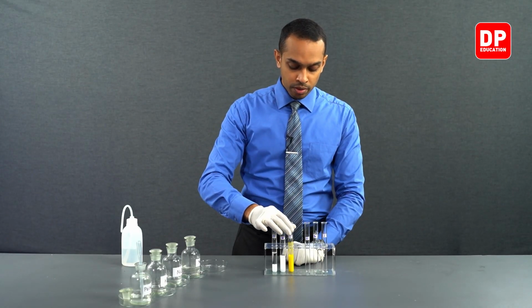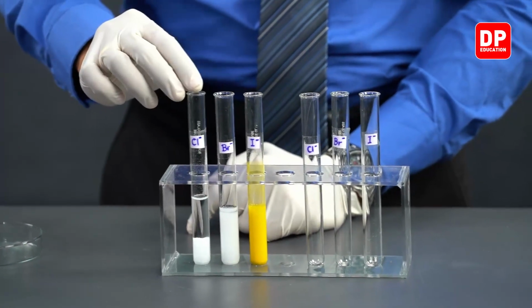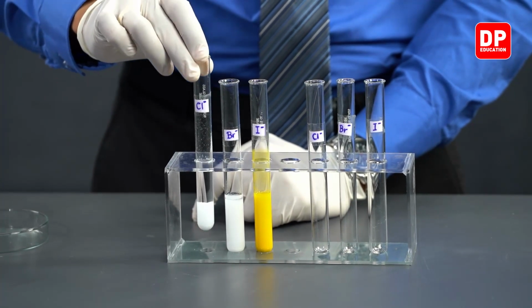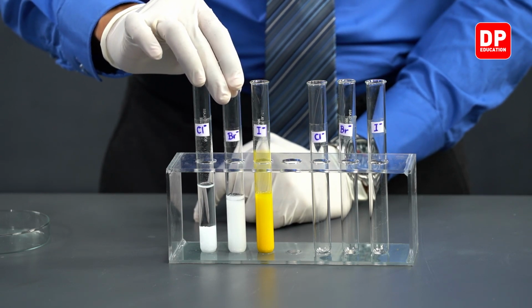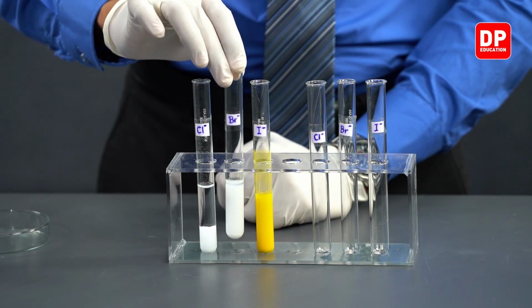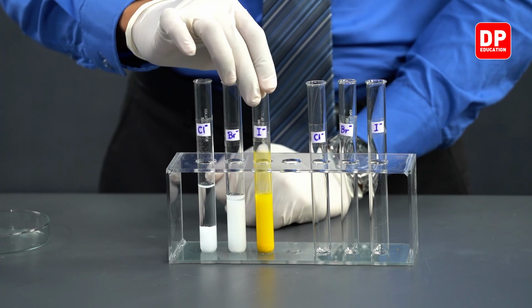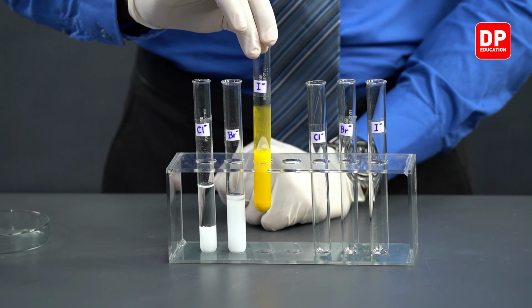And now we actually have a small comparison that we can make. When you have chloride ions reacting with lead ions, we form lead chloride, which is a white color precipitate. When bromide ions react with lead ions, we form lead bromide, again a white color precipitate. And when reacting iodide ions with lead ions, we form lead iodide, PbI2, which is a yellow color precipitate.